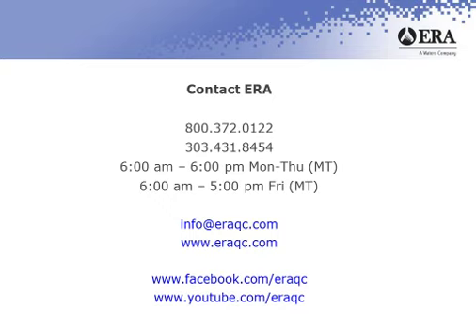Our first question: I have difficulty correctly identifying fluorescing wells using IDEXX SimPlate for HPC method. What do you recommend for troubleshooting? Generally, the HPCs may be foreign to most of the wastewater folks because usually it's a drinking water parameter, but there are some folks out there that do have to do some HPC methods. We do occasionally make it available for some of our participants in some of our studies. So I've done the method. It can be really tricky.